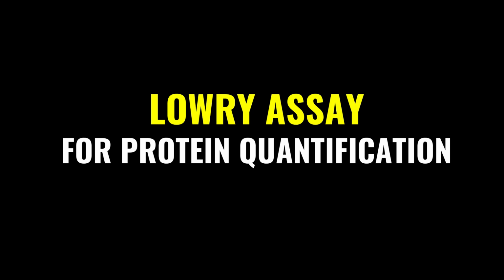Therefore, I will discuss it in detail so that you understand the components or the requirements and their role in this method. In addition, I will also discuss the underlying basic principle, how to set up the assay and a standard curve using bovine serum albumin or BSA. Its calibration, precautions, sensitivity and limitations will also be discussed in this video.